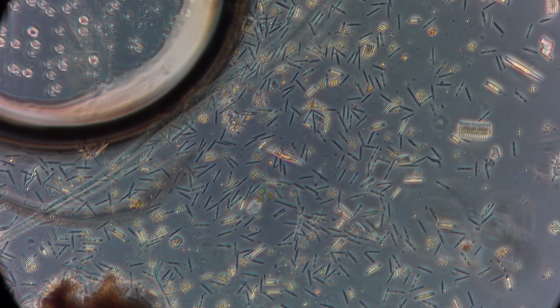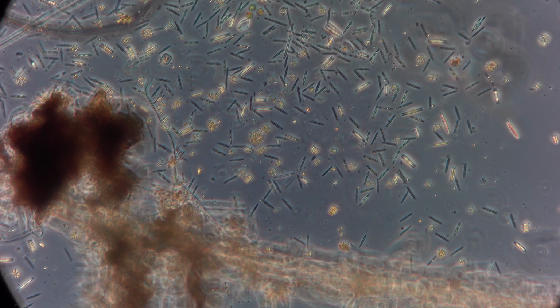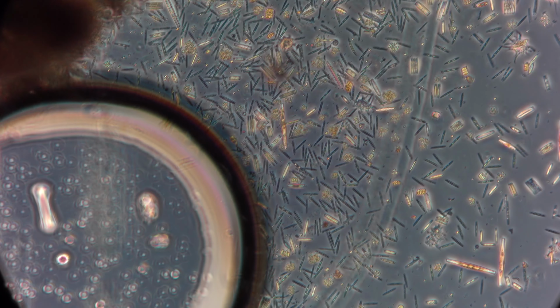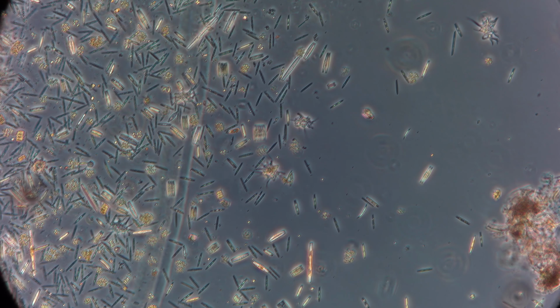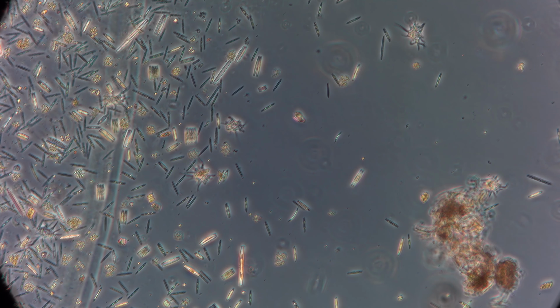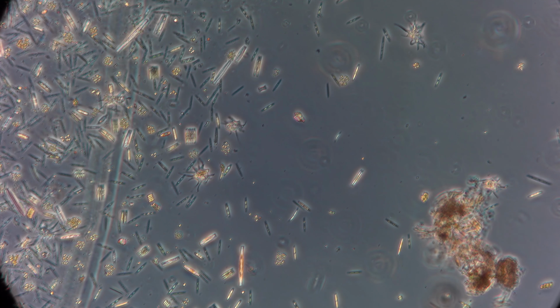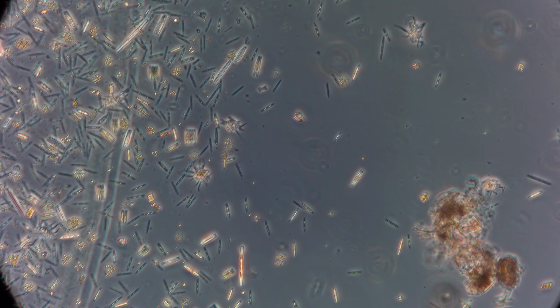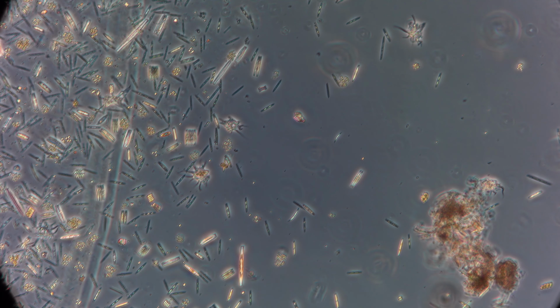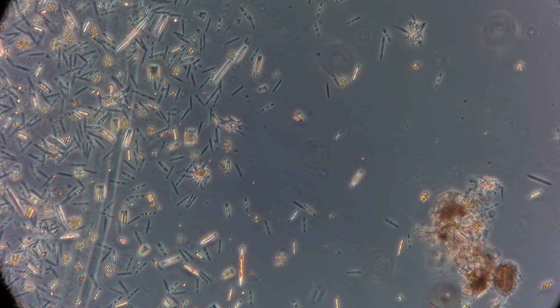So a bunch of diatoms here, and these are diatoms from the Charles River. They will also move. Like this diatom is moving. There's another amoeba. Oh, I'm liking this culture. Maybe I'll send Cricket this culture. They actually move by secreting a mucus and sliding along it. The diatoms? Yeah. So now we can try to do a time lapse, if there's enough of them moving.